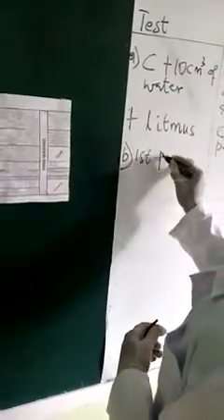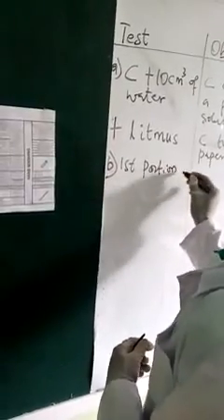Now the next question, B, says to the first portion of C. So they said to the first portion, do what? Add sodium hydroxide in drops and then in excess. That is NaOH. This is sodium hydroxide, but I don't know whether this one is still good. Maybe I should pour this one out and use a new one so that we can use it.